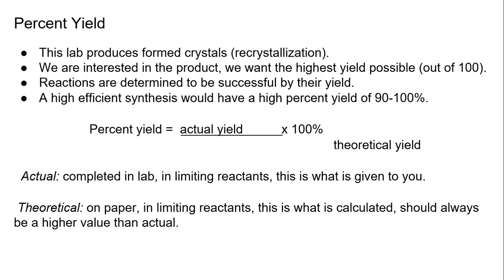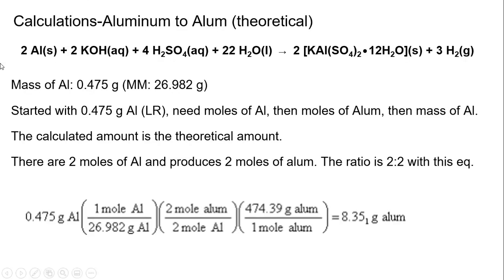So this is what we're going to do. We're going to calculate the theoretical. And with that theoretical, you're going to be given an actual on LabFlow in the data report part. And then you're going to determine the percent yield. So this is mine.